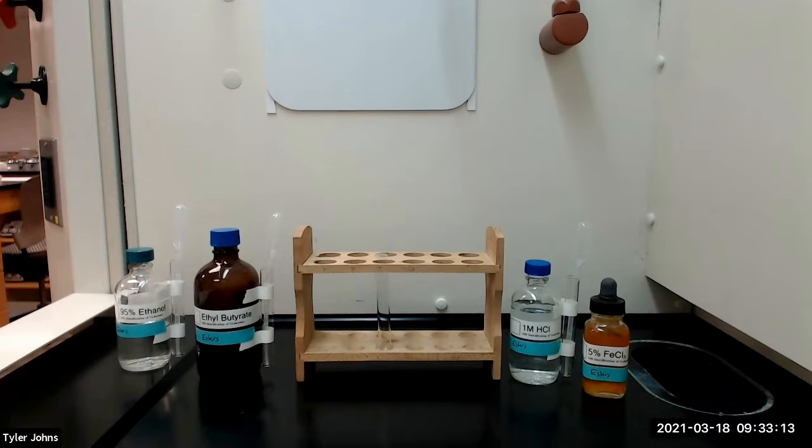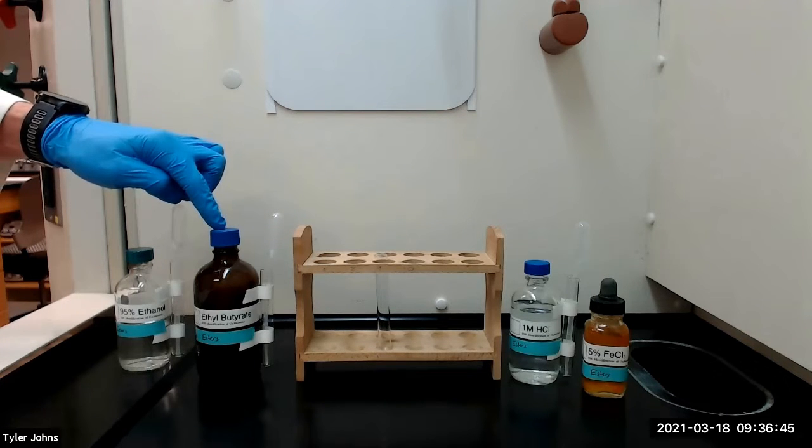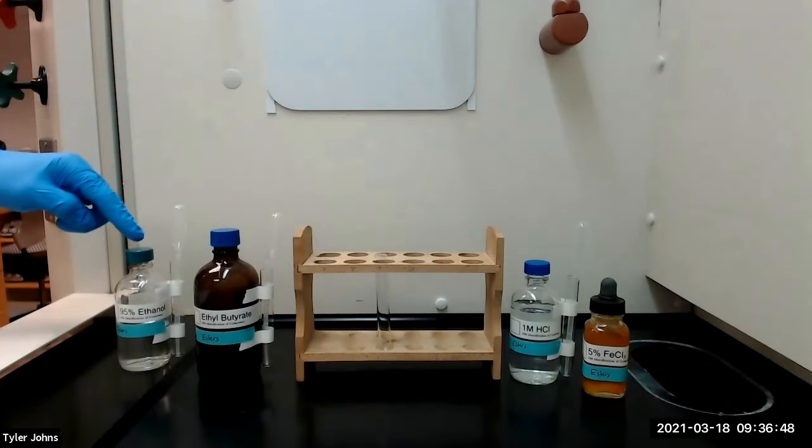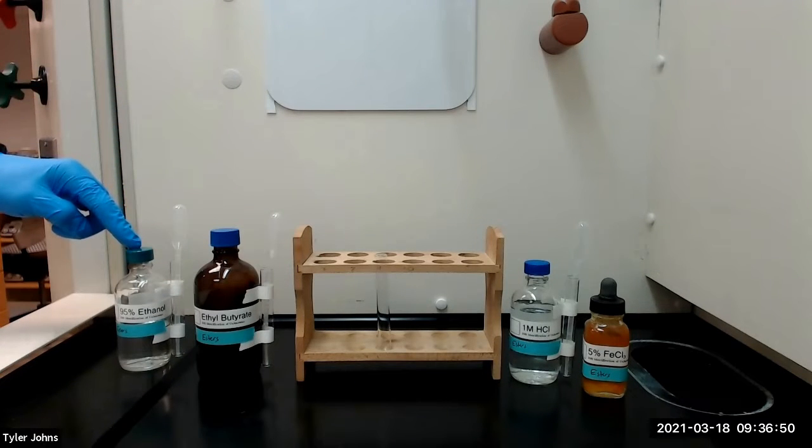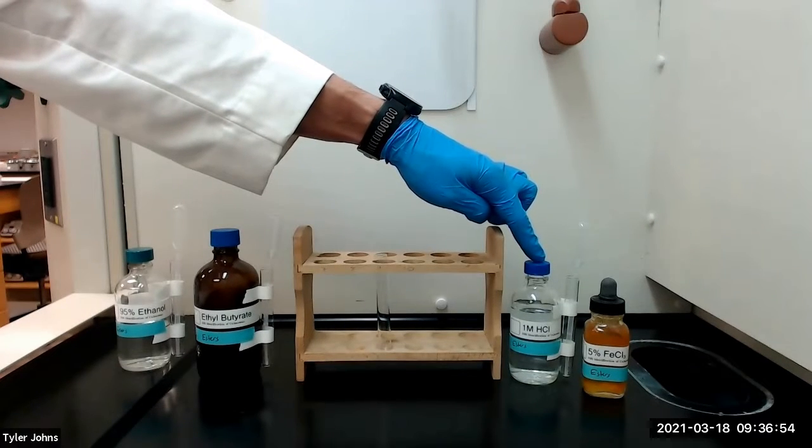If the compound gives a positive ferric chloride test, the ferric hydroximate test cannot be used. We will begin by dissolving a small amount of the test compound ethyl butyrate in a small test tube with one milliliter of 95% ethanol, and we will add one milliliter of one molar hydrochloric acid.